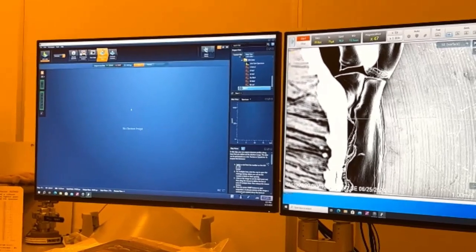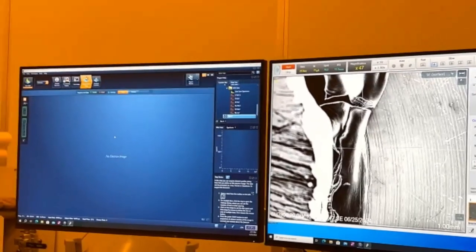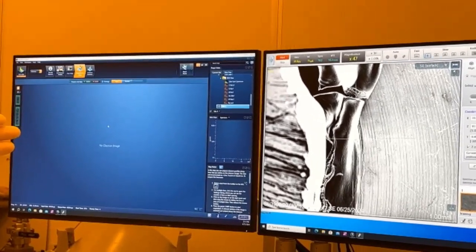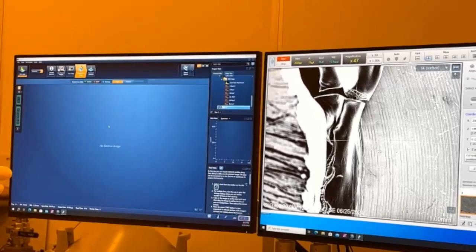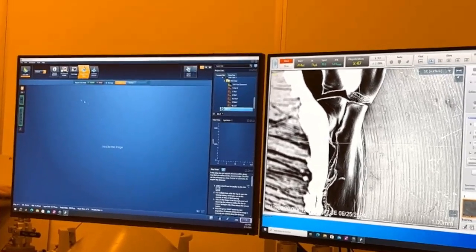And how did you stop that? I just came here and hit stop. So the live scan just keeps going. Right. And you actually have to stop it. Where the point ID and the analyzer will just scan till it gets the results it needs, and then stops.